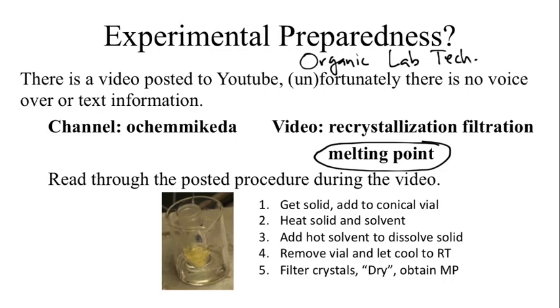There are a couple other big videos there that are going to help you out a lot as far as preparation for this experiment, particularly for your final practical. There is a recrystallization video, in fact two of them. You do not need to see the Craig tube one, so don't worry about the Craig tube recrystallization, we won't have to do that one. That one unfortunately doesn't have any audio, so you just get to read through the procedure while you watch me recrystallize a solid.